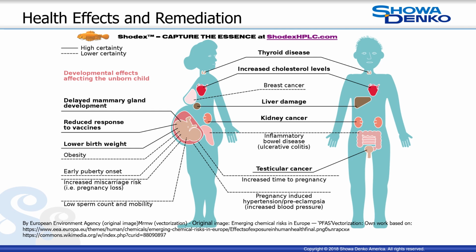Bioaccumulation is associated with many increased health risks, including thyroid disease, testicular cancer, and lower birth weight. Today, it is a primary concern to detect and remove PFAS from soils and water supplies. Constant monitoring is essential. There are several ways to monitor soils and water supplies. High-performance liquid chromatography is often employed for all water monitoring, including groundwater, drinking water, and wastewater. Moreover, liquid chromatography mass spectrometry, or LC-MS, is used for more sensitive analysis as local and federal governments continue to reduce the acceptable limits of contamination, now in the low parts per trillion, or PPT, range.